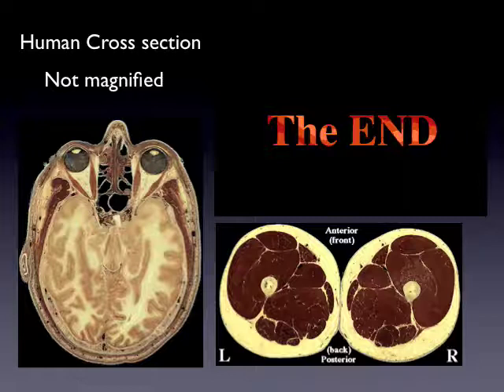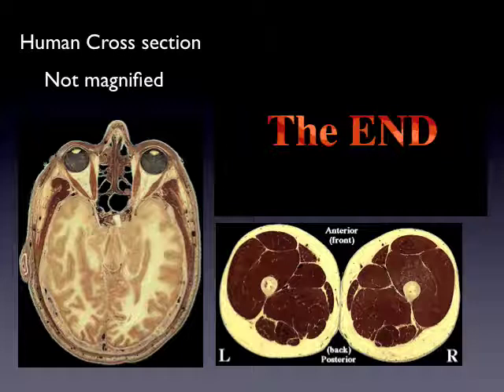The larger spaces would be the bronchioles — the tiny tubes that feed down into the alveoli. The air goes in there, and then oxygen and carbon dioxide move from the air into your body tissue and are transported around. Now if you look carefully, you can see tiny blue dots throughout all this tissue. What do you think those tiny blue dots are?